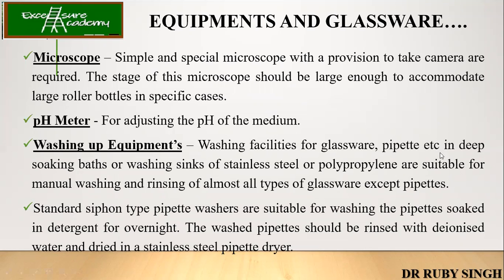But if it is glassware, then you need to wash it, then again sterilize it in the autoclave, and then dry it in the hot air oven. Yeah, it's a long process actually, but yes, all these are required in order to carry out. If suppose the pipettes are made up of these polypropylene things, then you don't have to wash it. You can actually throw also those which are made up of the plastic ones.